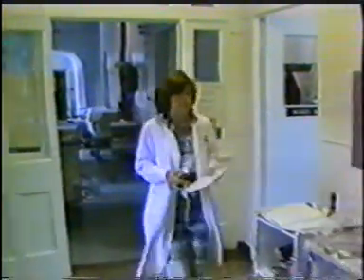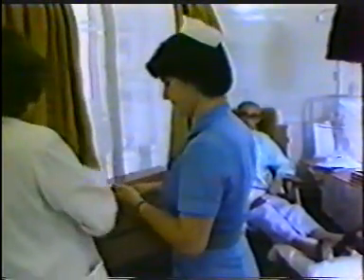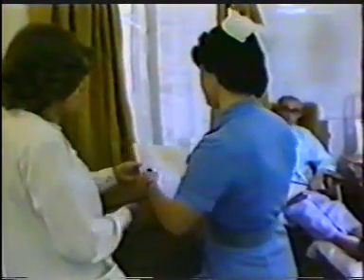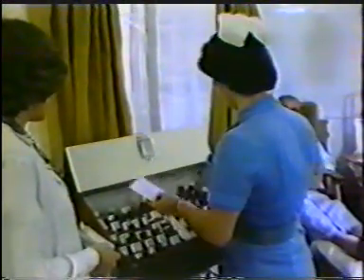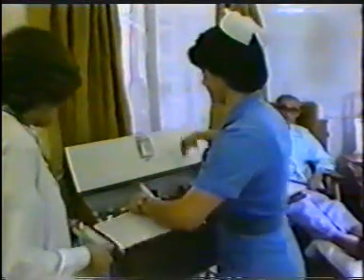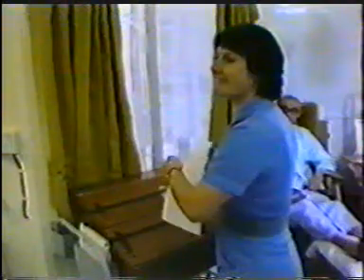Together, production and quality control staff work to ensure that only products of a suitable quality reach the patient. The purpose of quality control is to take an independent view of the production process and to carry out such tests as are necessary in monitoring it. The final responsibility for the release of a batch rests with the quality controller.